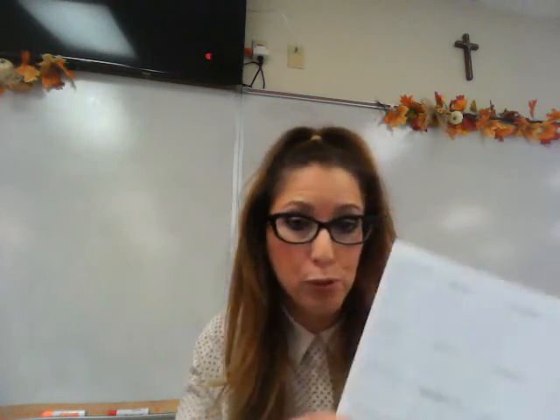Okay, now for C4, when you're heating and cooling iodine, you're not going to actually do this. There's going to be a video link on Canvas for you to click on to watch the heating and cooling of iodine. Okay, so you're going to record your observations. You're going to indicate the type of change that it is. I'll give you a hint. It's reversible. And then you're going to comment on it. Every year people forget to do this. They forget to comment on it right here. Okay, so please do that.